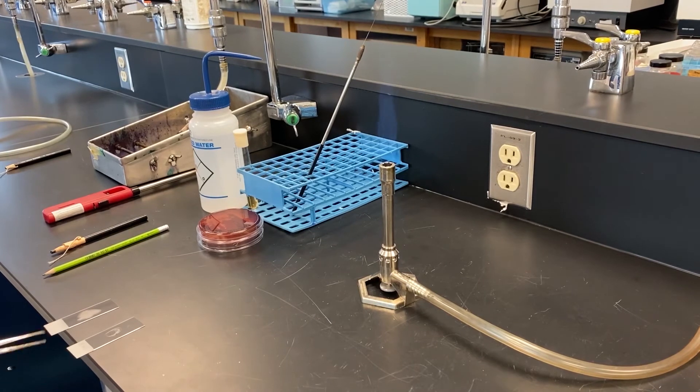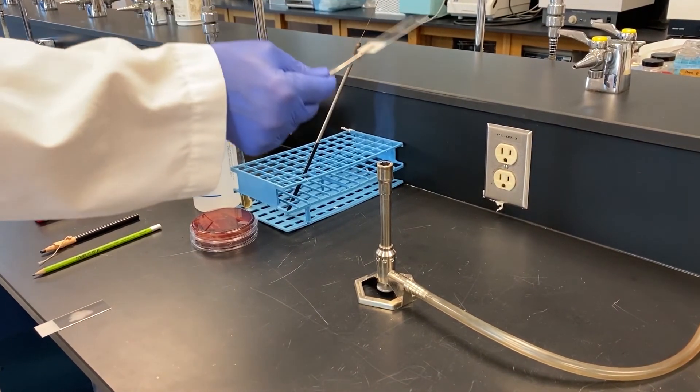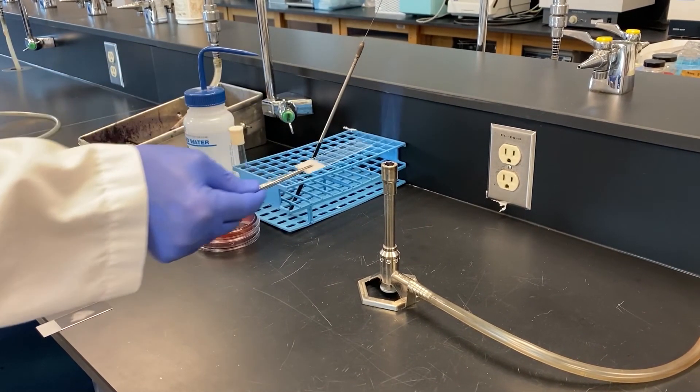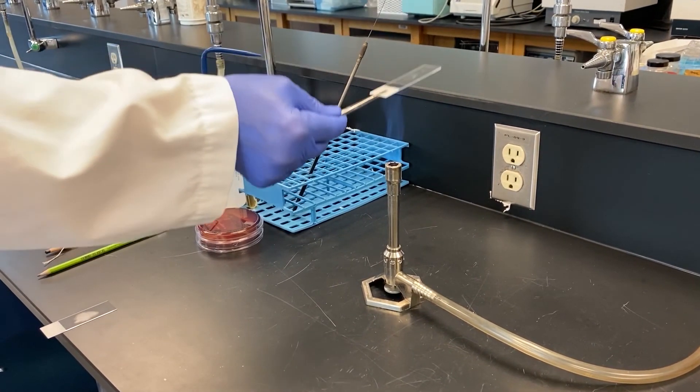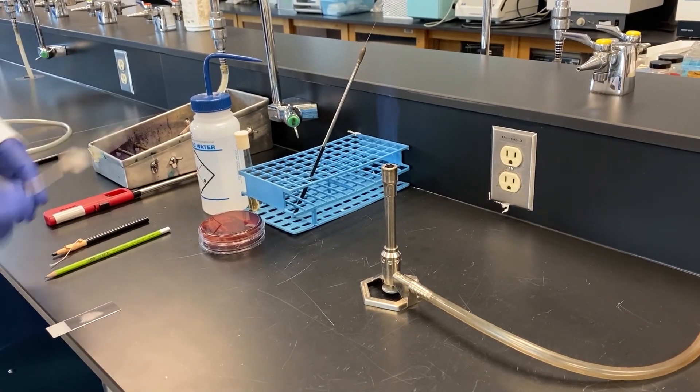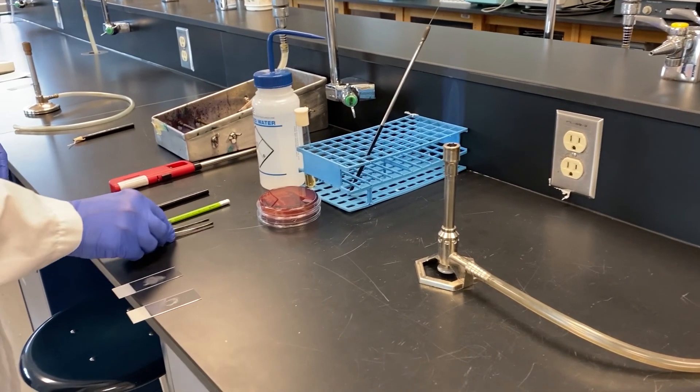The heat fixing process is very simple. Hold your slide with a pair of forceps and gently pass it through the flame three times. Do not hold it in the flame as this will cook the bacteria and we won't be able to see them under the microscope. You can carefully do a check using your hand to make sure the slide does not get too hot. Now your slides are ready for staining.